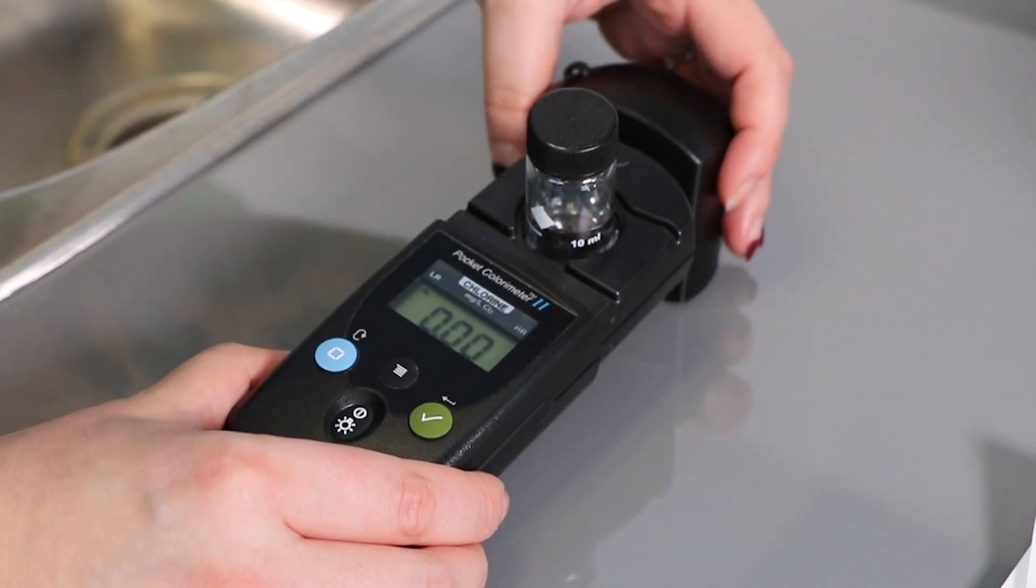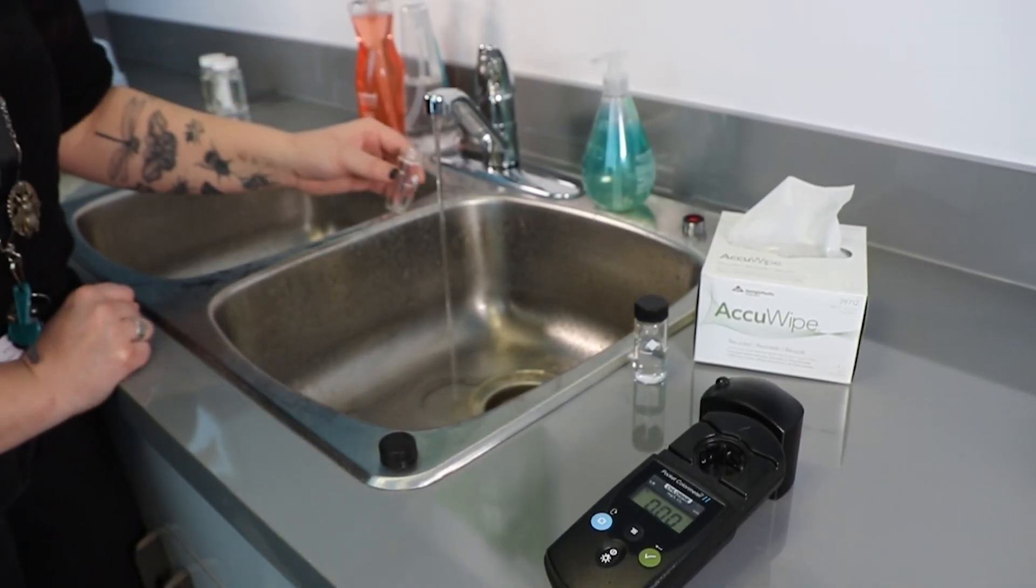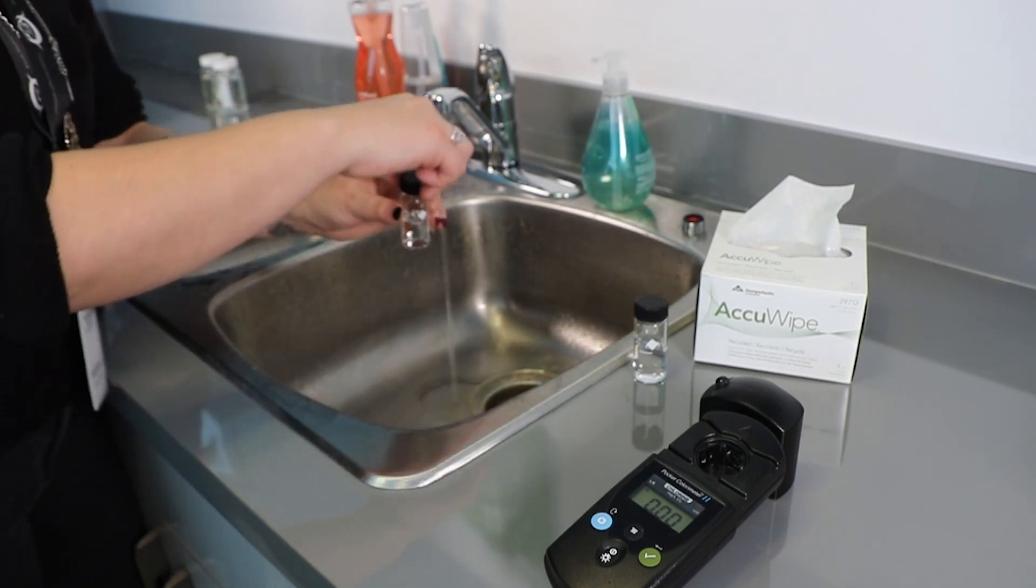Remove the sample vial from the measuring chamber. You have now completed meter zeroing. Fill a different sample vial with the water from the tap to the 10 milliliter line.